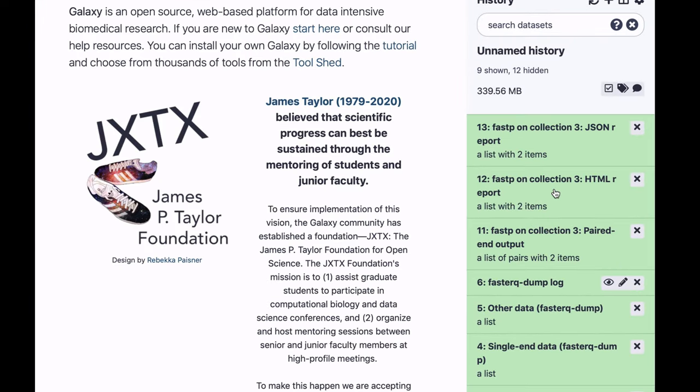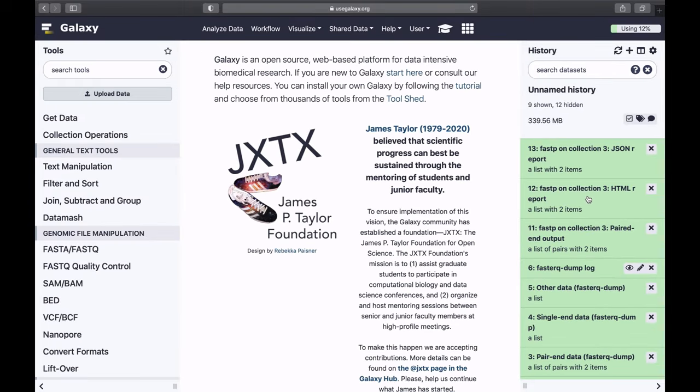Now FastP is finished. What it really does, it trims adapters, and it can also trim low-quality bases.